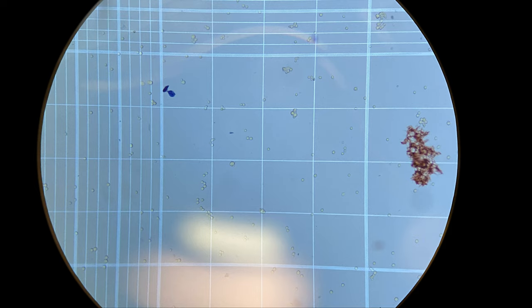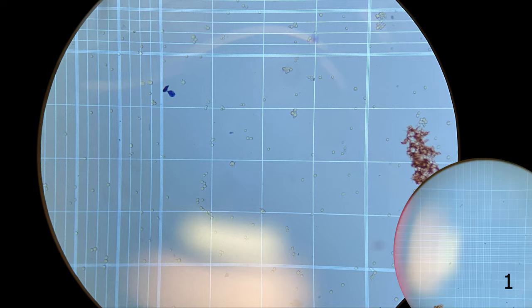As we zoom in on a higher magnification, we can see now a P-square in more detail. You can see the cells. You can also see where some things have been stained with trypan blue. These items here would just be artifacts. These would not be actual dead cells. You would not count those as dead cells. This one would be in the lower corner of your hemocytometer. Now you can see here, this is a four by four grid. So we're going to count all 16 of these S-squares in the one P-square.